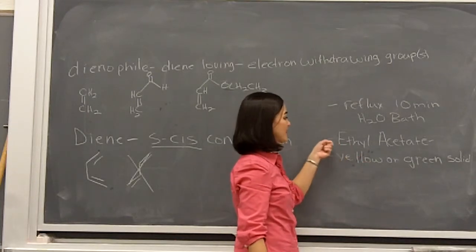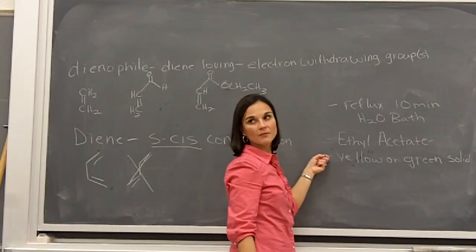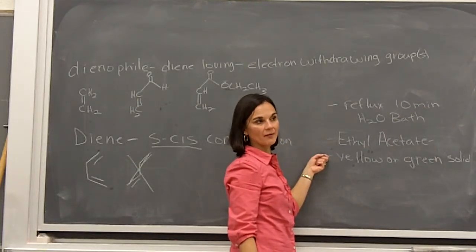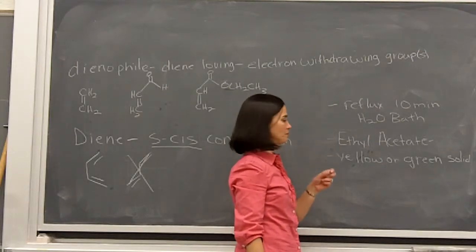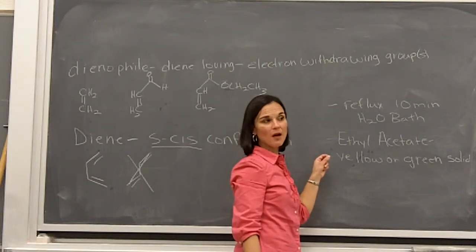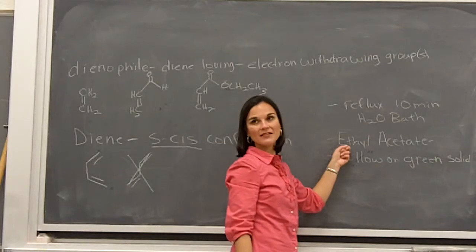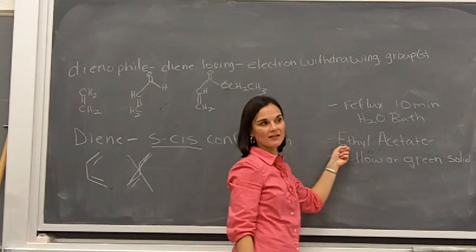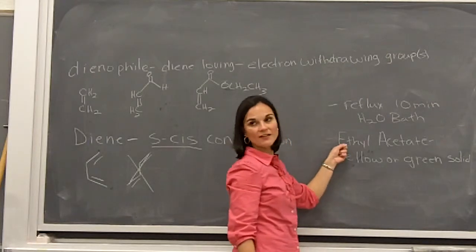You need to get it dissolved in the ethyl acetate, and then you will come to your instructor and get your cyclopentadiene, okay? So make sure that it is dissolved. If it doesn't dissolve, even after stirring, that's probably your first clue that it's possibly not completely ethyl acetate, and maybe you used the hexane ethyl acetate to set up the reaction, okay? So if it doesn't dissolve, there is a problem.